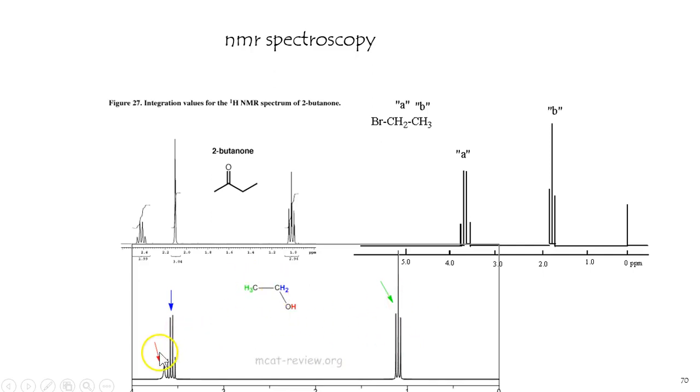The CH2, we're seeing a quartet, makes sense. 3 neighboring hydrogens plus 1. That OH is not considered a neighbor because it's next to an oxygen, so it's considered its own separate beast. That being the case, it has no neighboring hydrogens and should show up as a 1H singlet, meaning its area is 1. There it is right there. It's a singlet. And these are notoriously unreliable because water can mess it up, things like that. But there's your 1H singlet there.